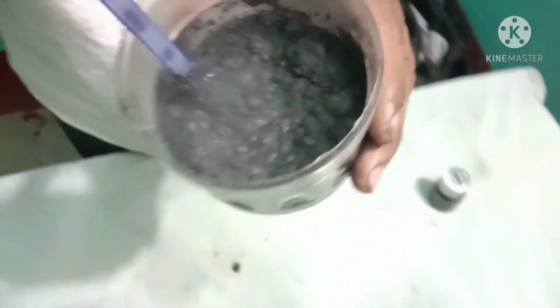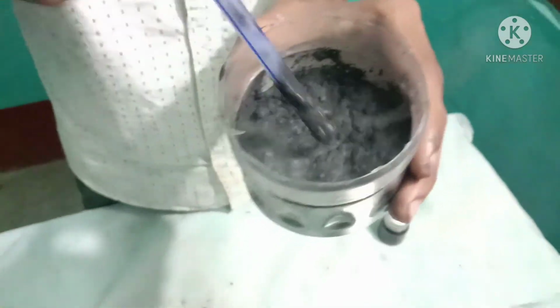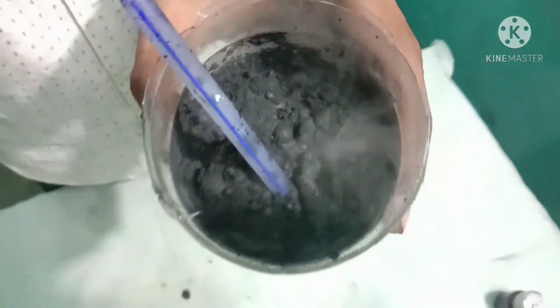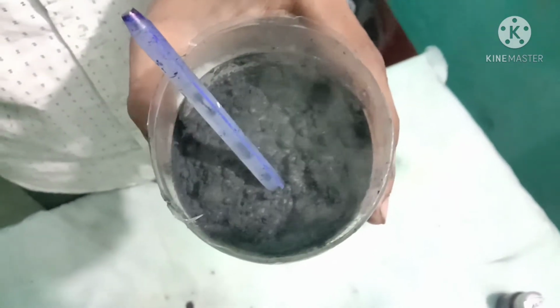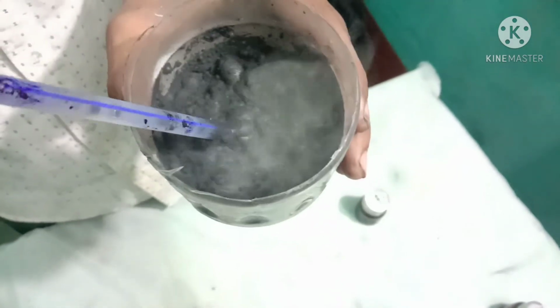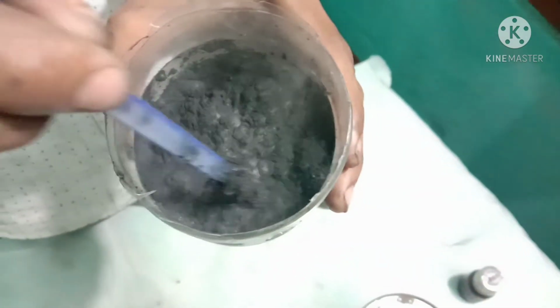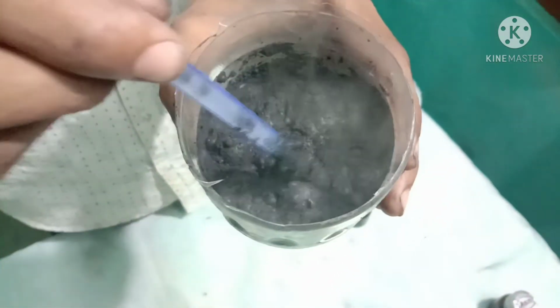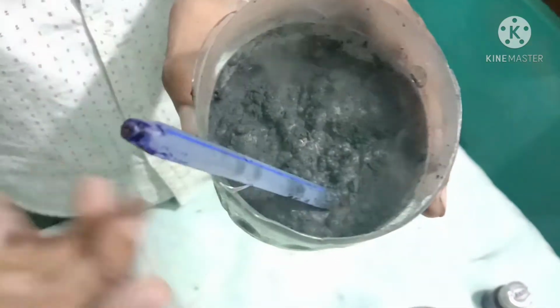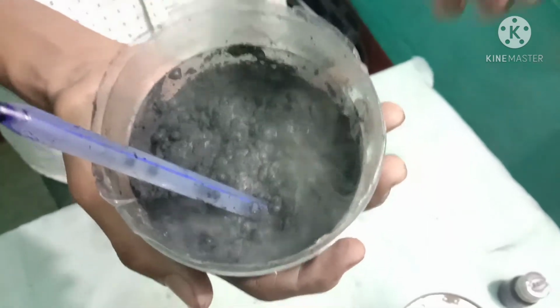So why this is happening is because when we put this hydrogen peroxide with manganese dioxide, the manganese dioxide is a catalyst. So it catalyzes the hydrogen peroxide and decomposes it into water and oxygen, and the oxygen is coming out from this reaction, and some water is generated here, and the reaction is exothermic, so the water is vaporizing out.